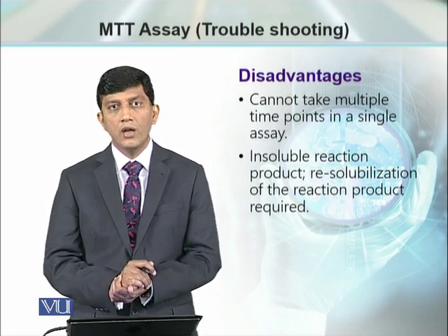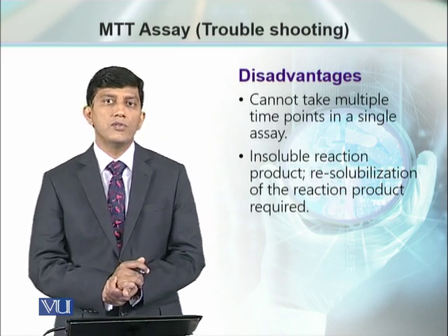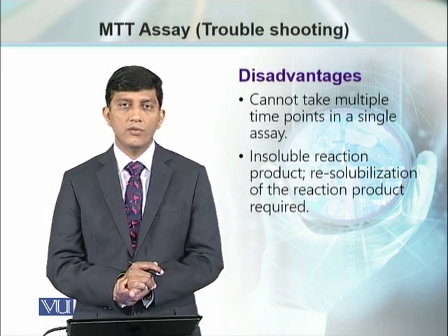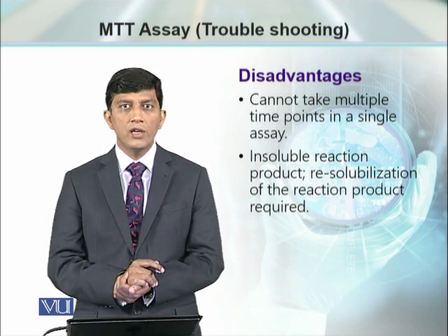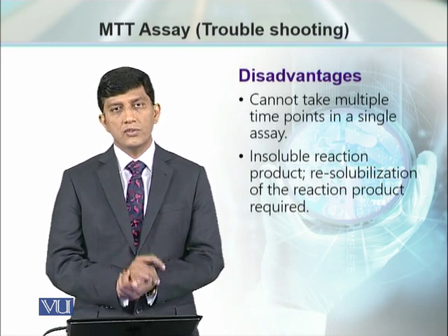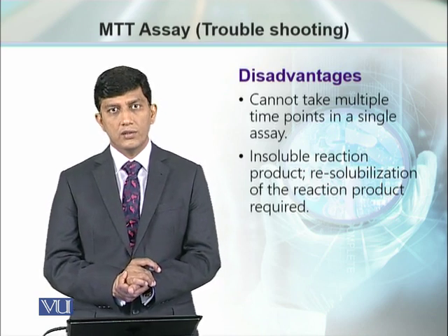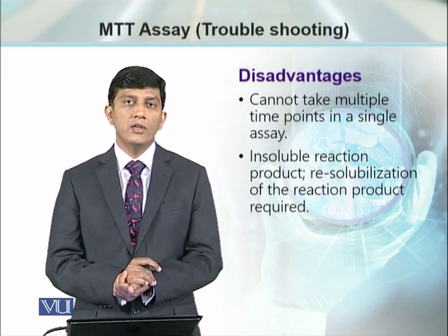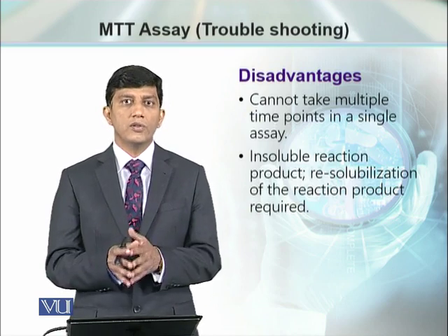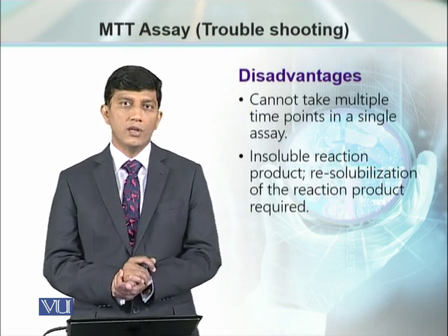This is an additional step which involves some acidic and some chemicals which may be toxic if not handled carefully. So these are very few disadvantages as compared to the advantages. So that is an inexpensive assay. People in the lab, they prefer to do it because of its advantages over disadvantages.